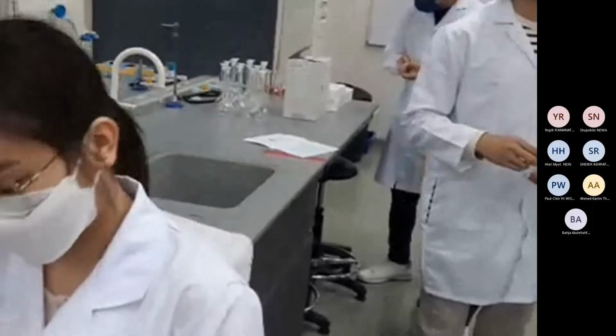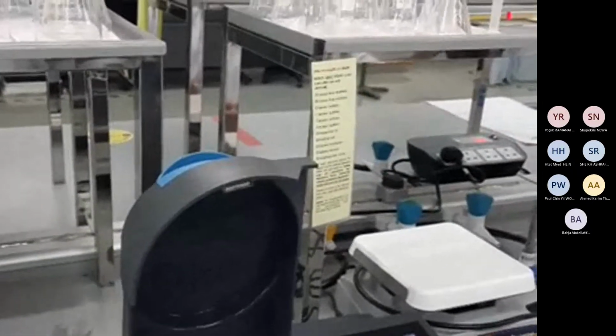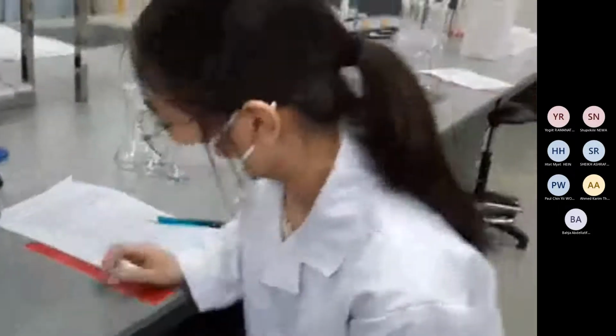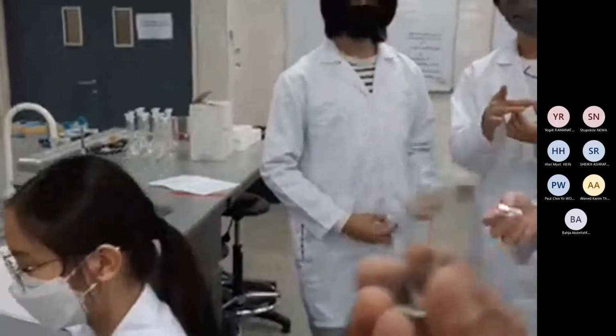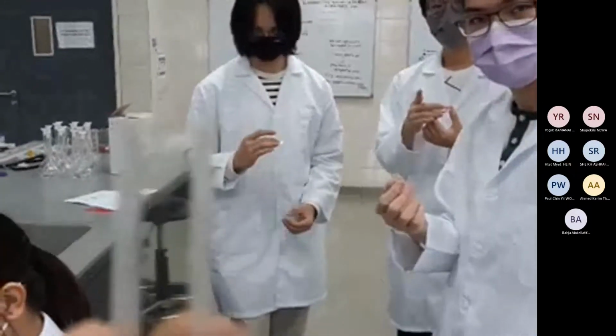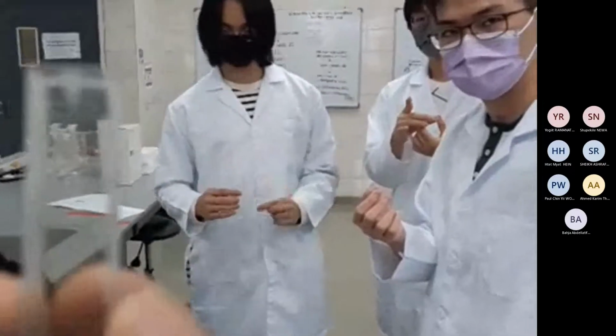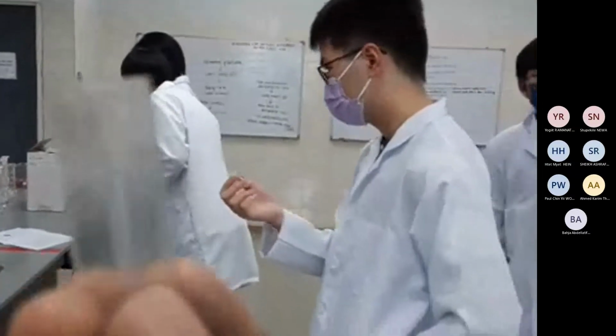Another thing is that you will see a triangle on one side. The two sides directly opposite are clear. This side, with the triangle mark, is opaque, and this is much clearer.